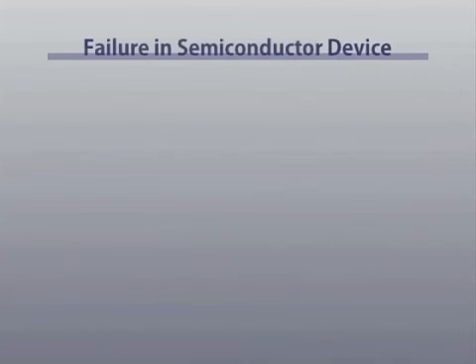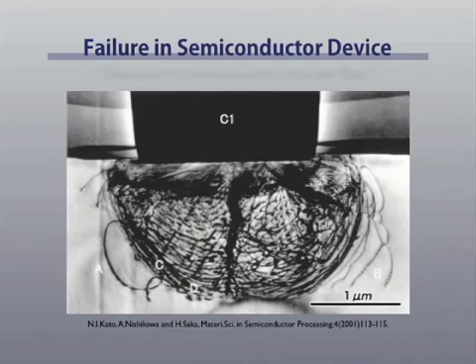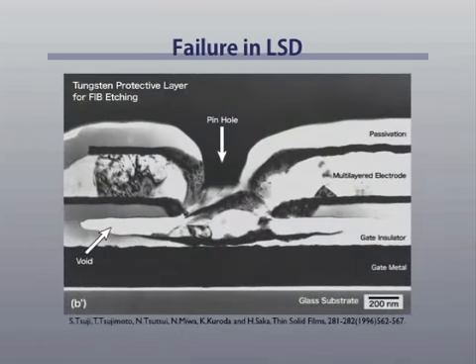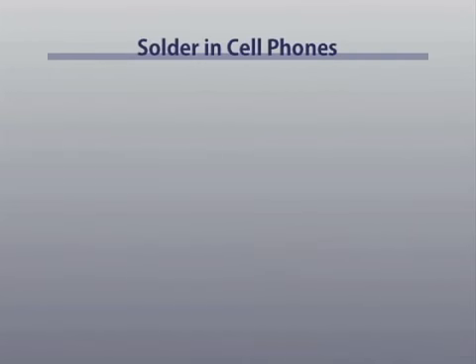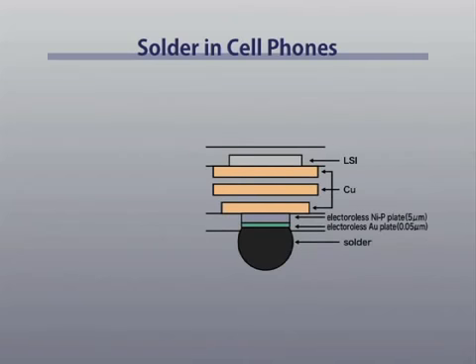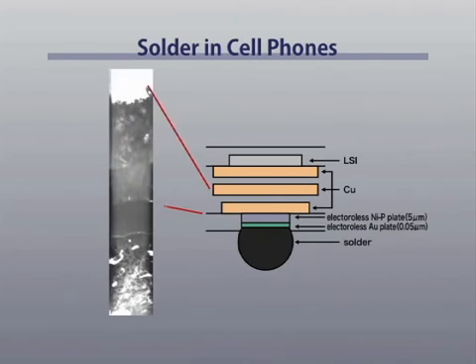Electron microscopy is a powerful tool for the study of bioscience and nanoscience. It has been used widely in industries as well. For instance, it is indispensable for the failure analysis of semiconductor devices and optical devices. The size of failures in such devices is so small that an electron microscope is the only way to analyze these failures.